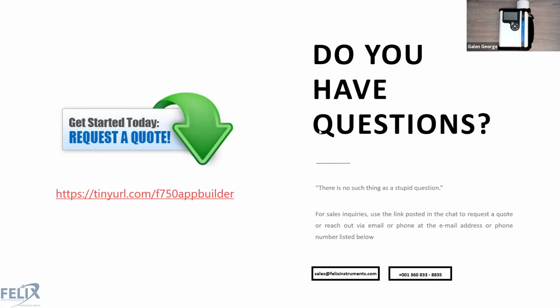Yes, Dorian, absolutely. Even if you had one folder that had 3 folders in it, and each of those 3 folders had 3 folders, and each of those 3 folders had 3 folders, you click that one overarching folder, and you click import, it'll go all the way down to the very farthest end of the root, and it'll order in exactly the right order that those folders are in. Yeah, it's been one of the most helpful features of AppBuilder, in my opinion. For someone who's doing a lot of the model building, it's been a very important feature for me.